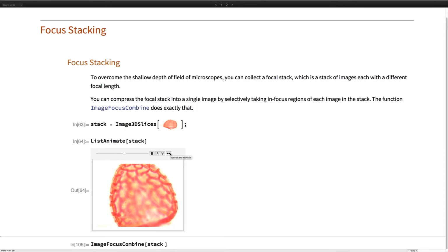is very, very thin. In contrast, if you take, for example, ordinary photography and have a telelens, then the depth of the field where an object is in focus may be really pretty big, maybe a few hundred meters wide. Under a microscope, it may just be a few micrometers thick. So essentially, if an object is thicker than the depth of the field, then you are out of luck. You cannot get everything into focus.